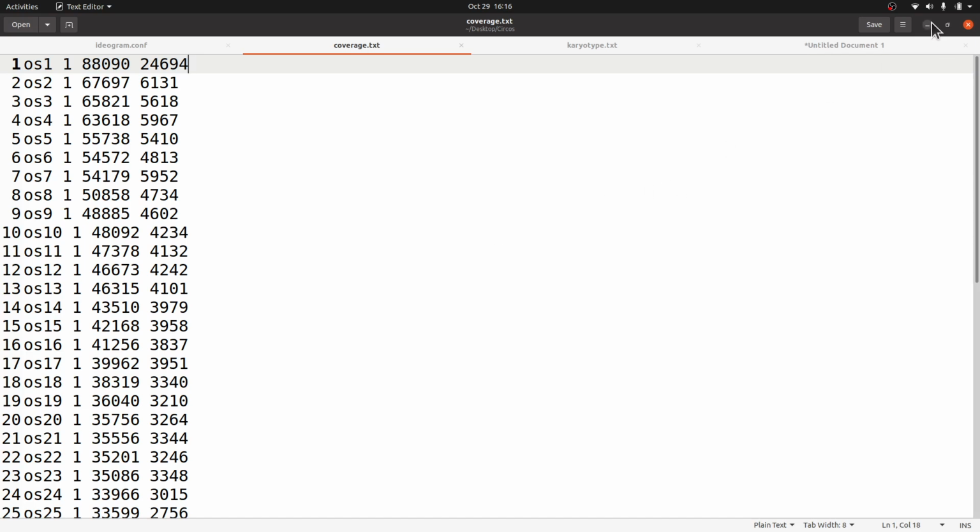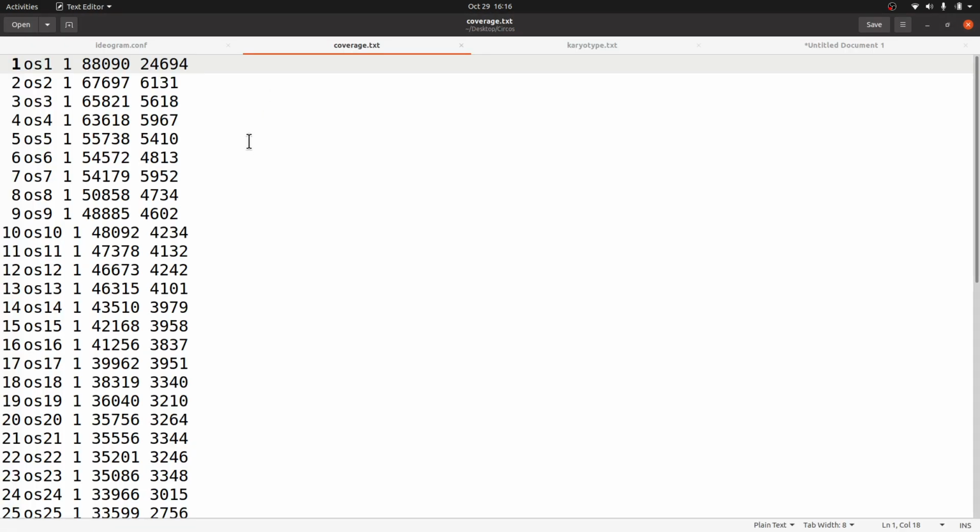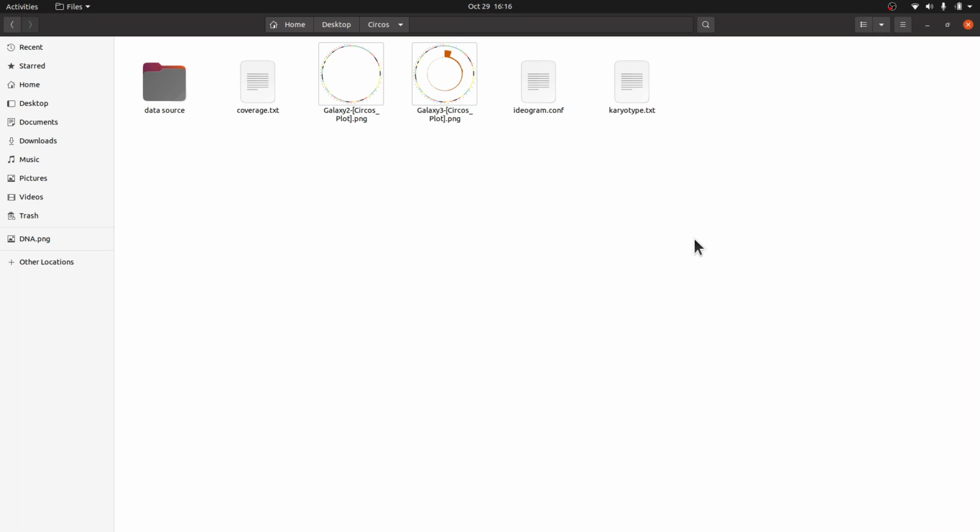And this requires some form of manual work and some form of scripting. If you have R or Python or any programming language, you can just use that to extract the information. All right, so the information here is not straightforward. You have to extract it and then compute it in the way that you want and use it. So that is where it's important to consult an expert to help you do that. Of course, you can also reach out to me if you want something like that, and we can look at how best to do it.